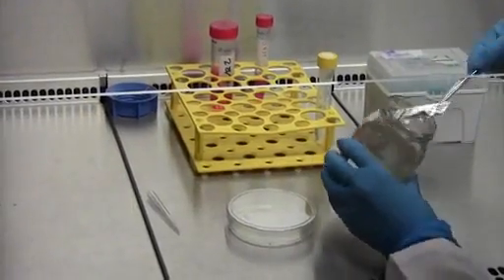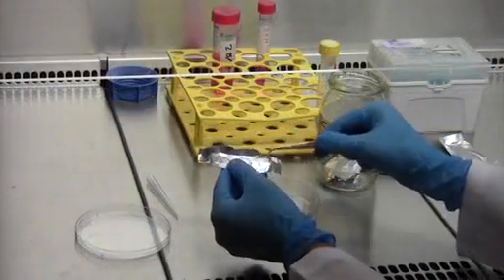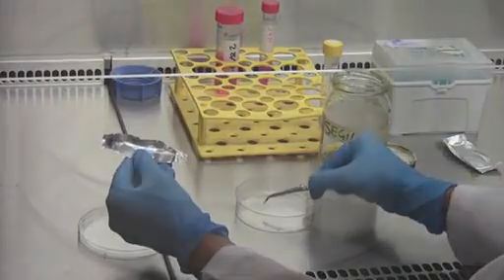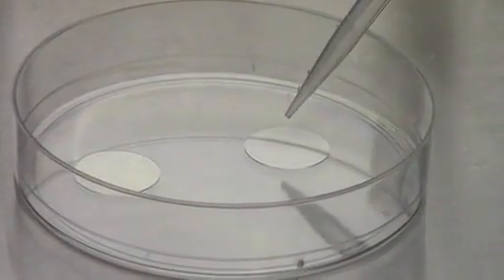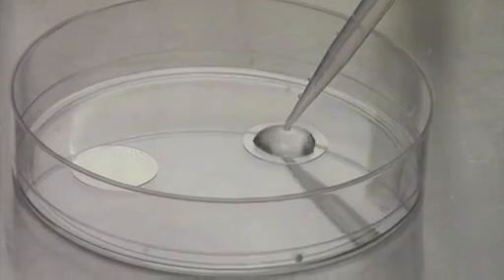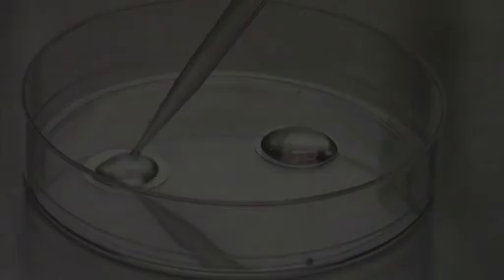Take packed and autoclaved cover slides and place them in a 10 cm petri dish. If you are working with an easily detaching cell line, such as HEK293T like in this experiment, coat the cover slides with sterile filtered 0.01% poly-L-lysine solution.